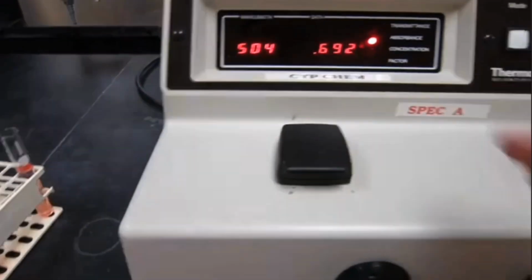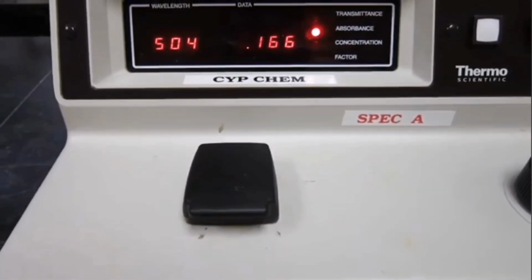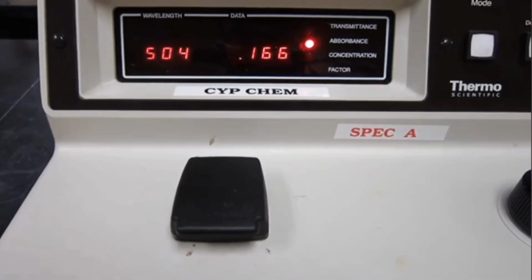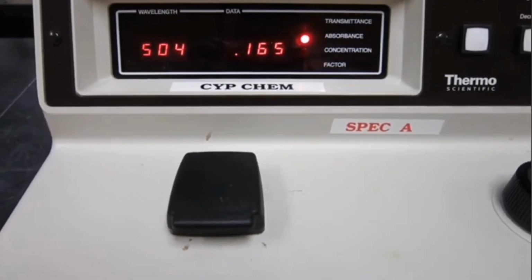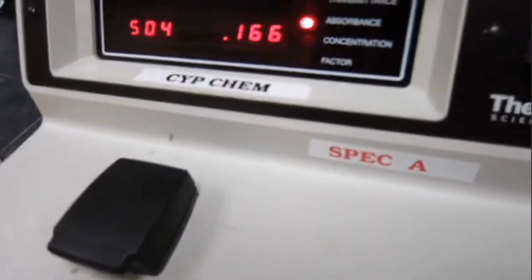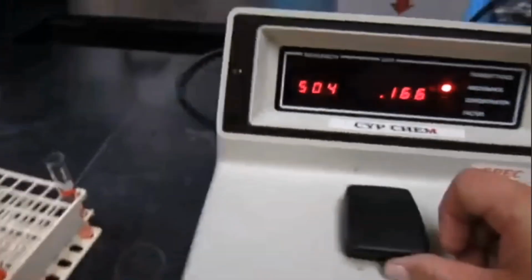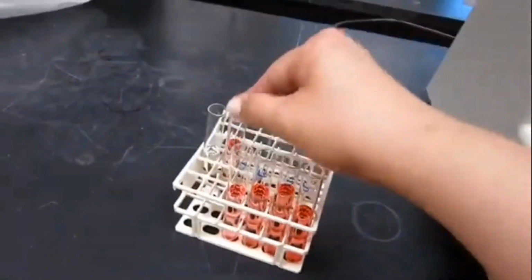Water would be 0 since we did not have any Allura red in it. And this is our first solution. You just have to put it inside. It's already been calibrated for you at 504 wavelength, which is the maximum absorbance for Allura red solution.